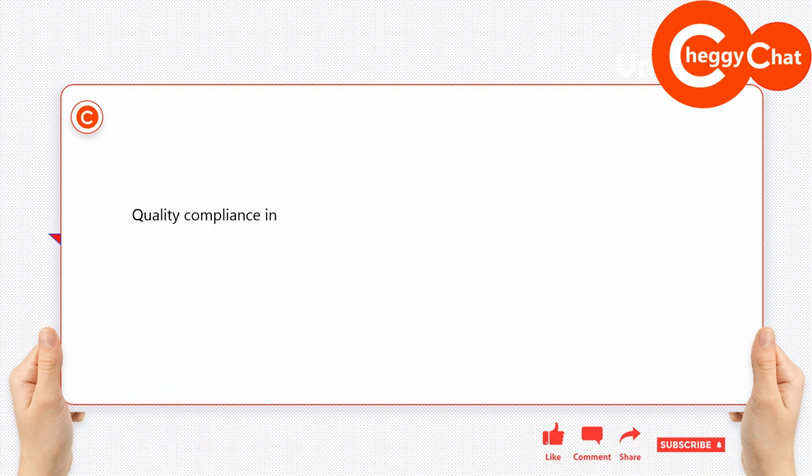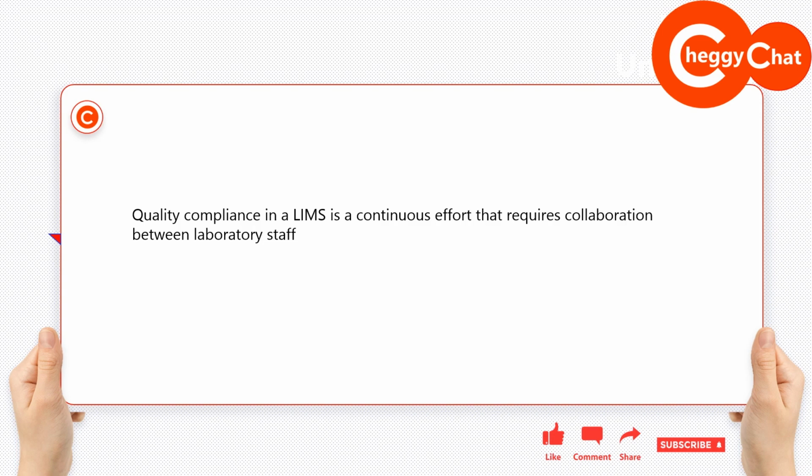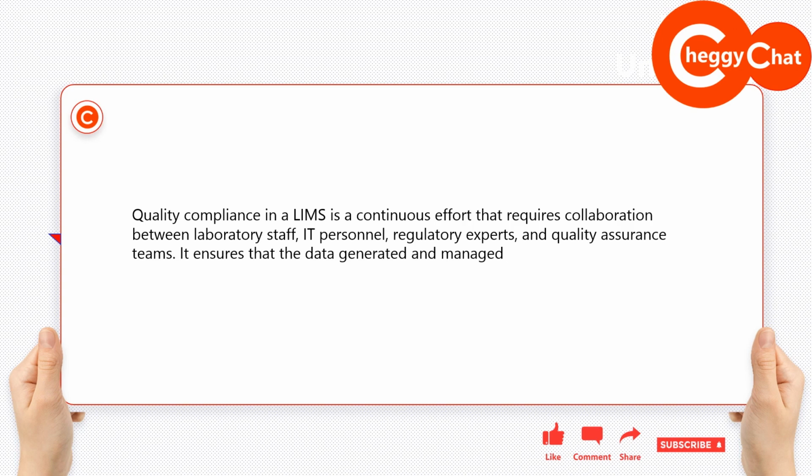Quality compliance in LIMS is a continuous effort that requires collaboration between laboratory staff, IT personnel, regulatory experts, and quality assurance teams. It ensures that the data generated and managed by the LIMS can be trusted for making critical decisions and meeting regulatory requirements.